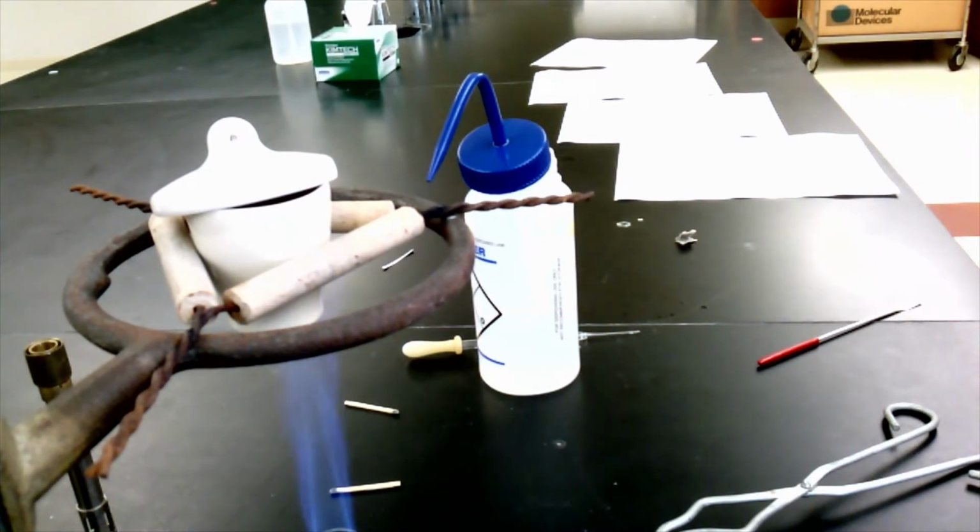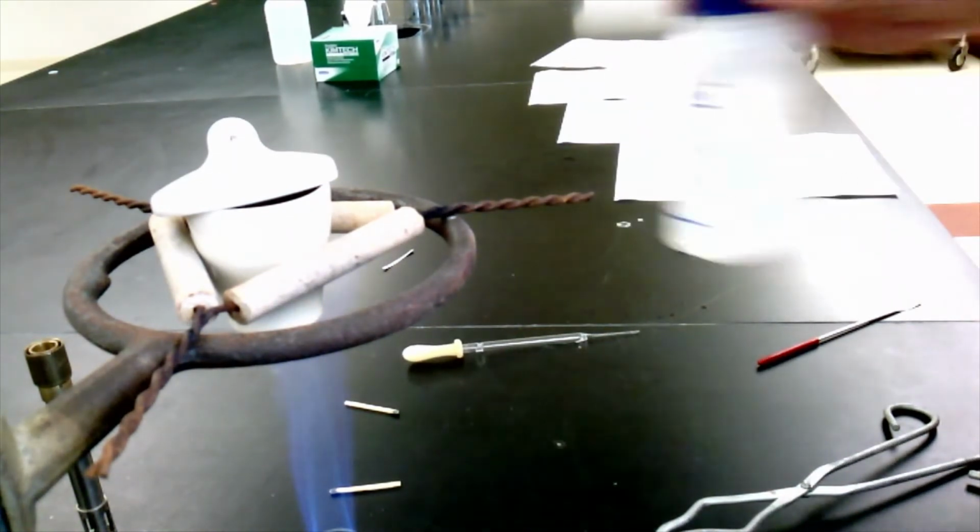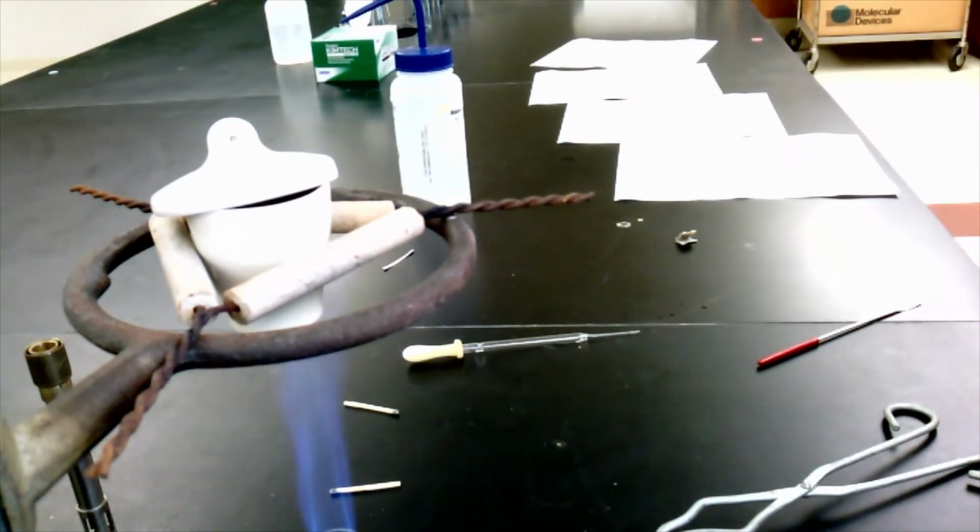The excess water that I added, and also the water that will be released by magnesium hydroxide in order to convert over to magnesium oxide. I'm also driving off, or heating off, all the ammonia that formed from the nitride. Okay, the magnesium nitride reacting with water gave us ammonia and magnesium hydroxide.